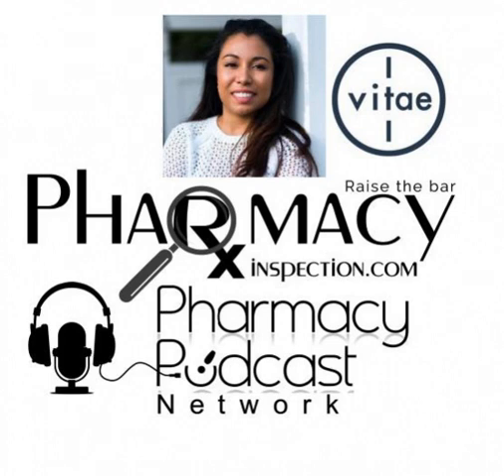And just to add another point, one of the beauties of automation is that you have very high repeatability between each step. So when we're testing these, we will test every tablet in an entire batch of either 30 or 90 via HPLC to ensure that we are accurately printing and producing these dosage forms. So just the very fact that we're using an automated system with some of these error checks built in gives us a really high degree of certainty on the end product. That is a great point.